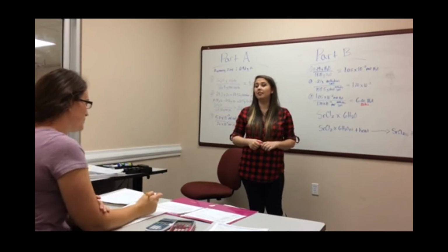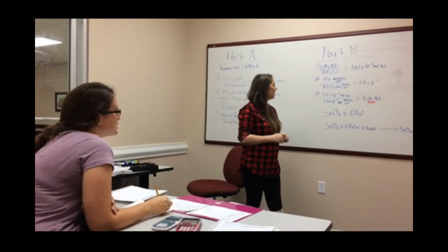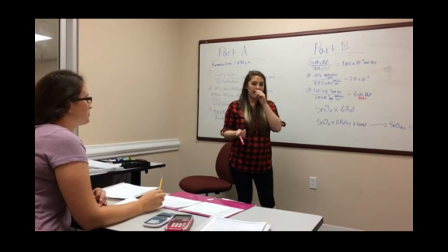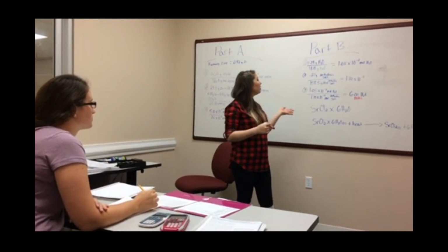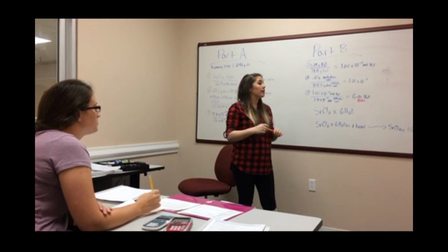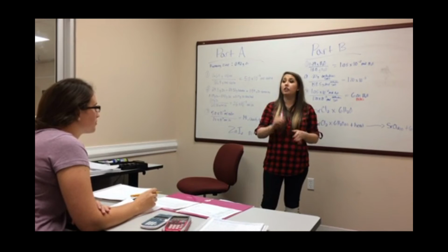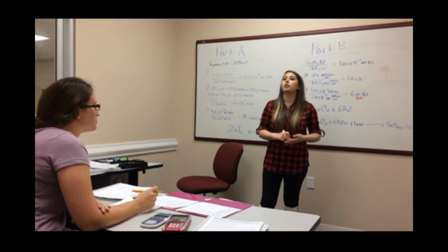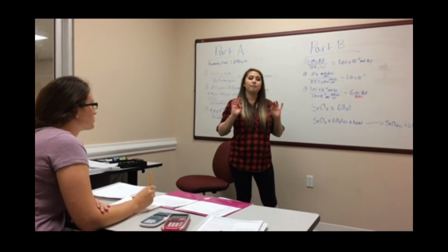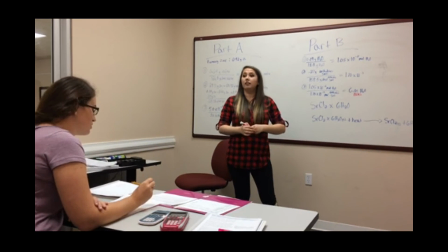Yes? Miss Nyrider, during my experiment, I accidentally spilled some during Part B. So what do I need to do for that? That'll be okay. It will skew your results. It's going to make them a little bit less than what they should be, but I just want to make sure that you're aware and that I'm aware that you did spill some things. Make sure you note that in your observations, note that in your conclusion, and that way I can get an idea when I'm reading over your results and your conclusion that I can kind of be aware of that and then base it off of that. Okay, good. I will do that.